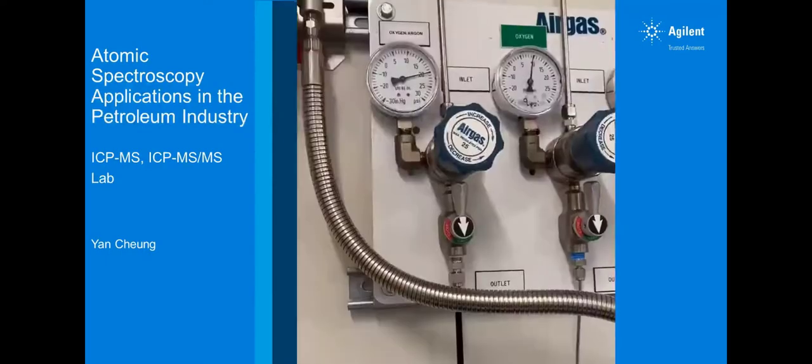Hi, so I hope you enjoyed the mini lab tour. Now let's get to the main topic of today's webinar, which is to introduce organic samples in an ICP-MS. But before I get to that, first I wanted to show you all the things and the conditions that you will need to get your instrument ready for the introduction of organic solvent.